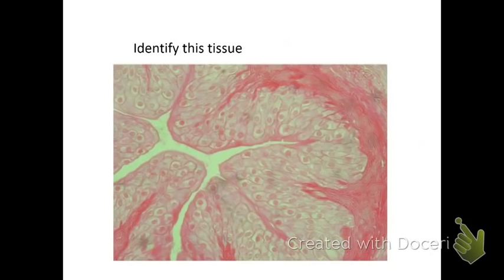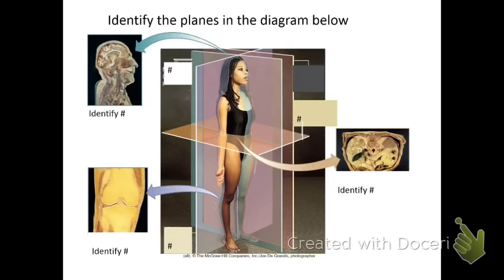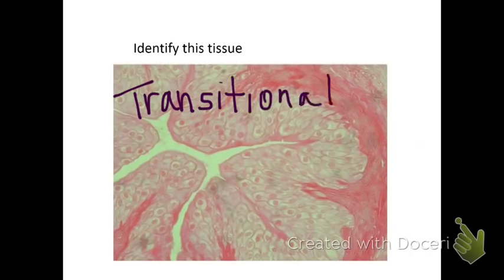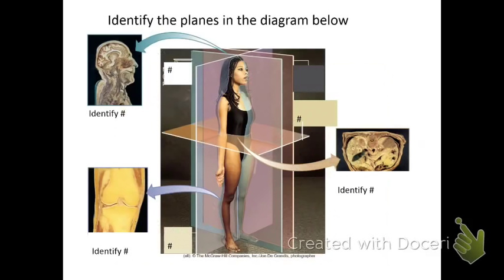Take a second and figure that one out. This one is transitional epithelium, because it goes from the cuboidal to the flat. Your notes say they're dome-shaped, and it stretches out. This is in your bladder. This picture you'll see on page 19 of your lab book.